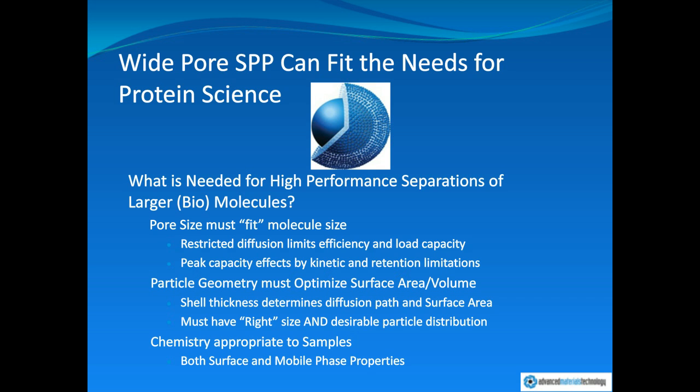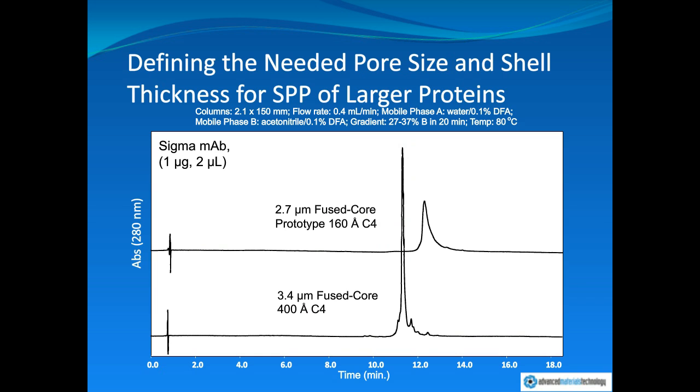So you have to have the right sizes of the pores with a correct particle size distribution, pore size distribution, and thickness. And of course, you've got to get the chemistry right. So we spent quite a lot of time exploring these relationships in order to draw conclusions about what's the right sizes, what's the right geometries.